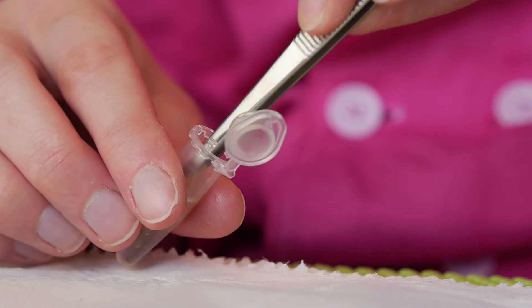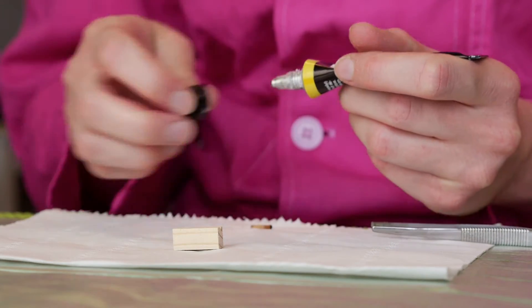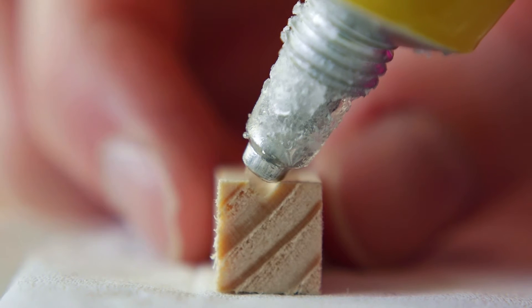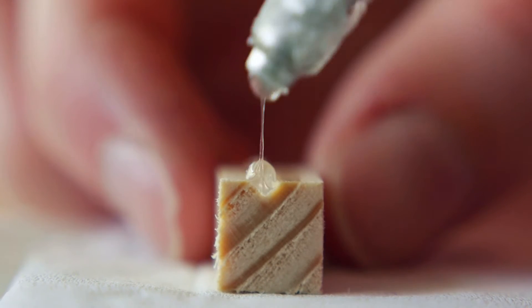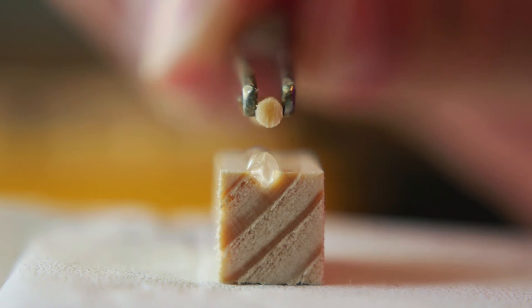For processing, let the sample dry on a tissue for approximately half a minute. This enables the glue to better attach to the wood. In the meantime, put some glue on the wooden holder. Use the forceps to mount the sample on the holder with the glue.